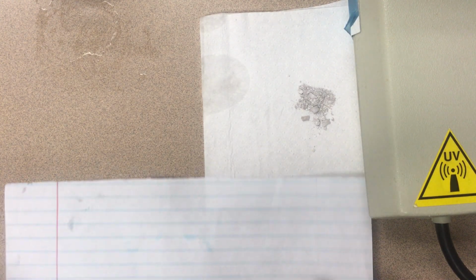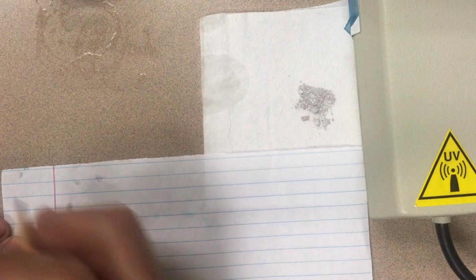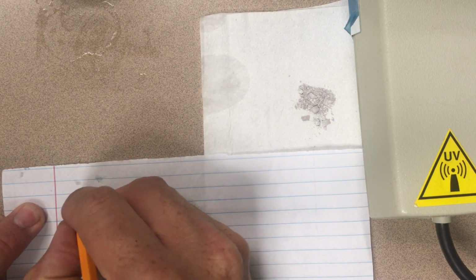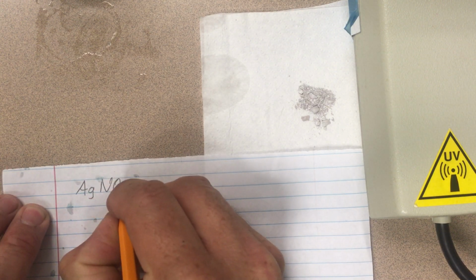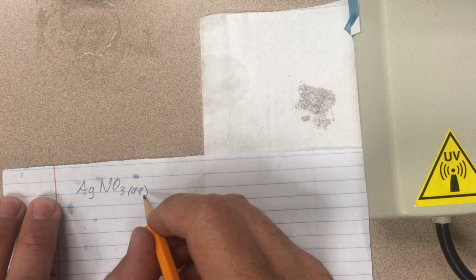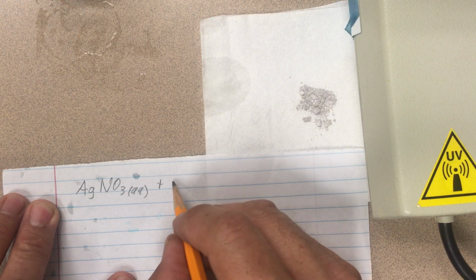Okay, so what we have here is a reaction between silver nitrate in solution and chloride ions. So let's say our solution has some sodium ions as well.